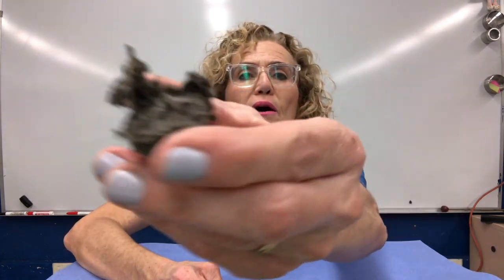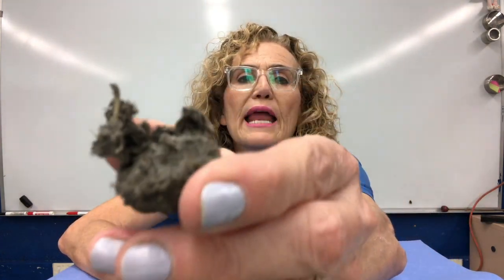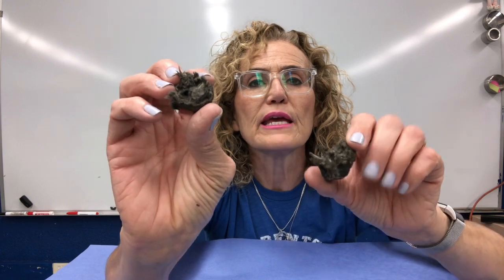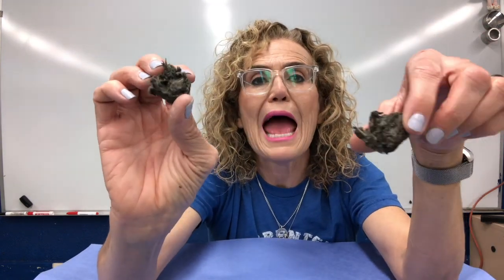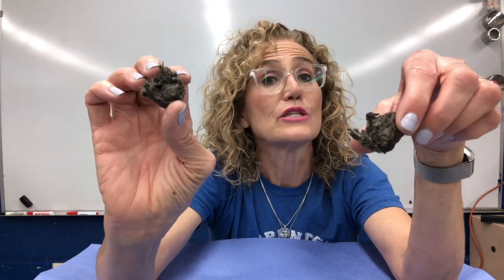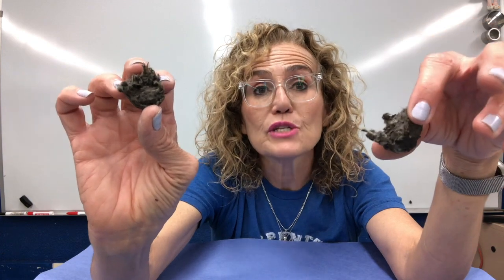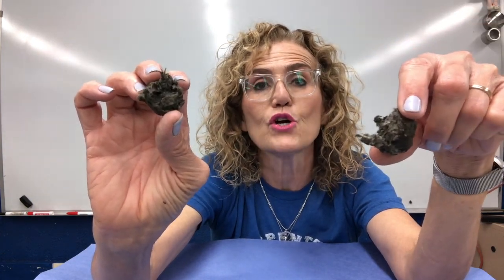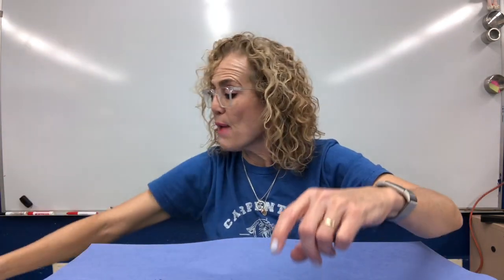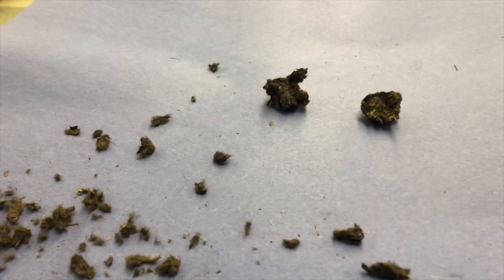Okay. So now, look, I have a little bone right there. Do you see it? And I'm going to now very carefully take all the little pieces of the bone out of this pellet. It's going to take me a little while. You're going to have to be very careful. You're going to have to take your time. Slowly, slowly take the bones out, pick the fur off, and then compare them to the bones on the chart.